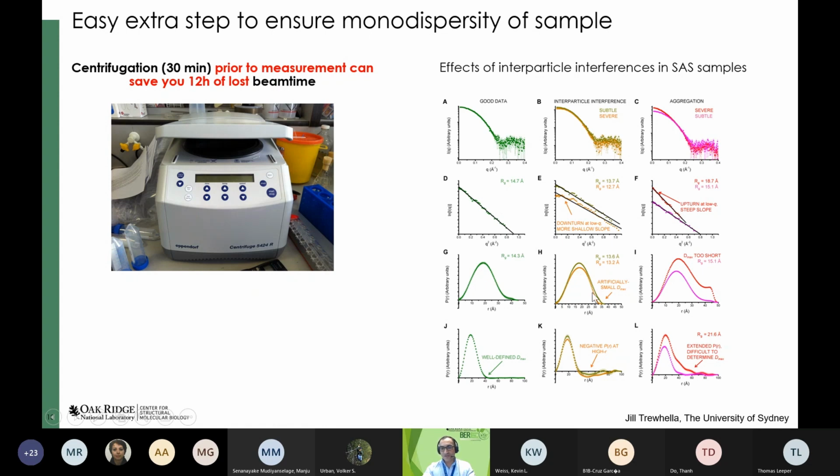And you see the difference between the regular PDDF, which is monodispersed, going to a Dmax, which goes too fast to the Dmax. And if you extend the Dmax, you see a negative PDDF here for long distance. That tells you that our data was corrupted.